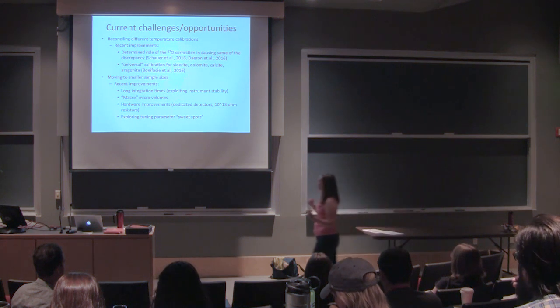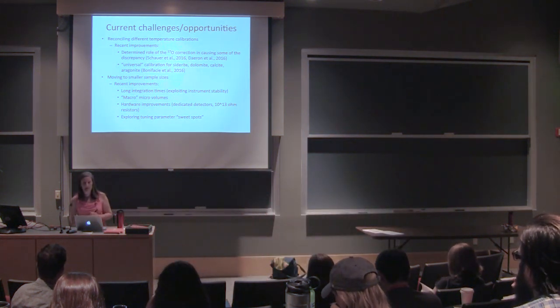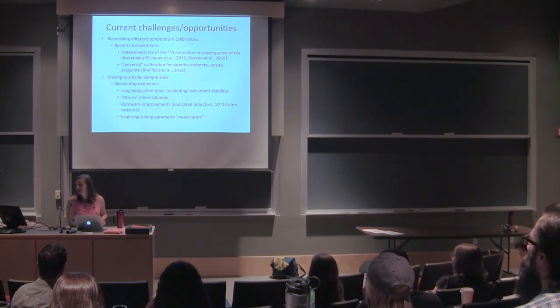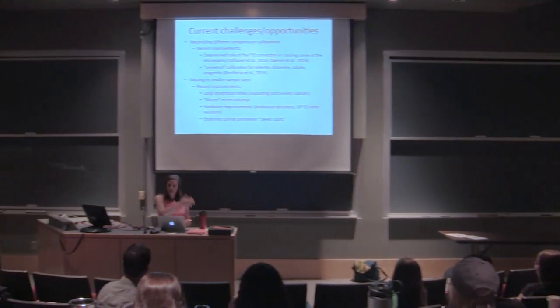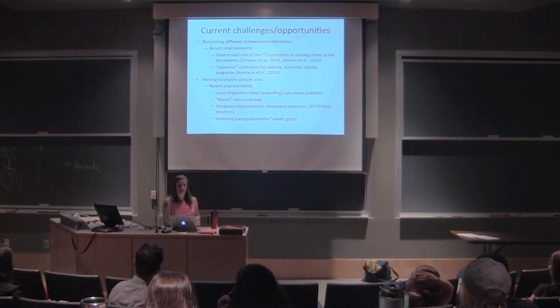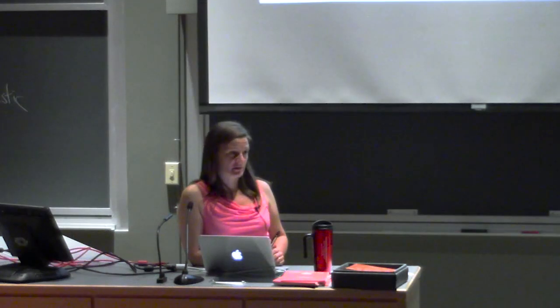So I'm super excited about that, and playing with other kinds of things. You can play with all of your tuning parameters. When they gave you the mass spec lecture, they showed you all the different tuning parameters you can play with, on the source end, for getting your beam into the right place with the right intensity.